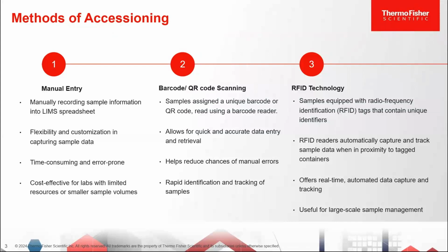Scanning technology also enables quick identification when you need it. When you need to pull something out, you can easily get a quick read and know exactly what your sample is. So it helps with the tracking of the samples and obviously better sample management.